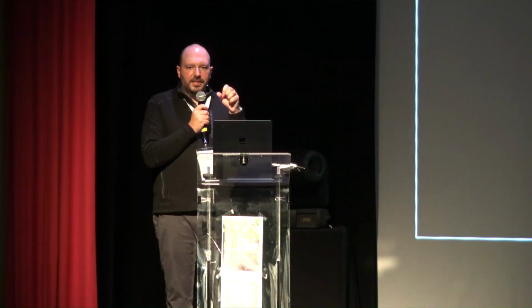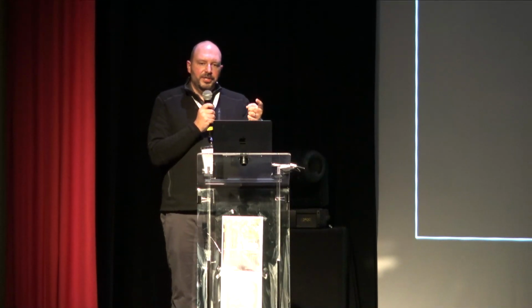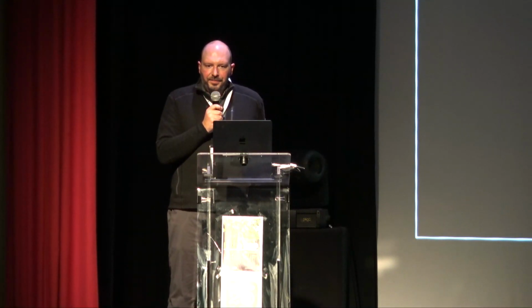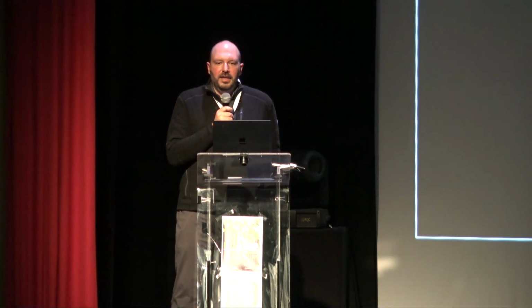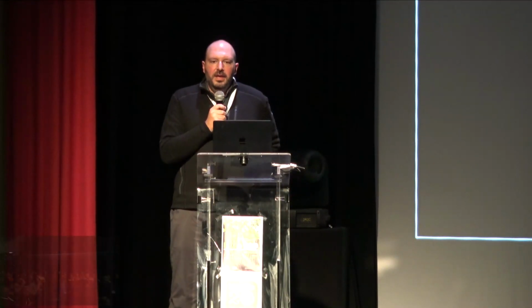But with mice, you can express the protein. And then before each imaging bout, you inject with some of the dye, and you can then image. Typically, we inject a day before we're doing an imaging experiment, and we've done that up to 8 weeks in a mouse.